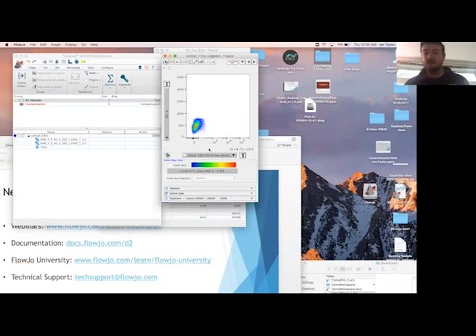All right, so the calculation just finished, but I've got one more question. What happens if you have some non-matching parameters in one of the channels? If you had non-matching parameters, we would have run into problems potentially in an earlier step. Essentially, when you do the concatenation, only those parameters in common for all populations selected will be included in the concatenate. In this case, all of them were in common, so we got all of those parameters.